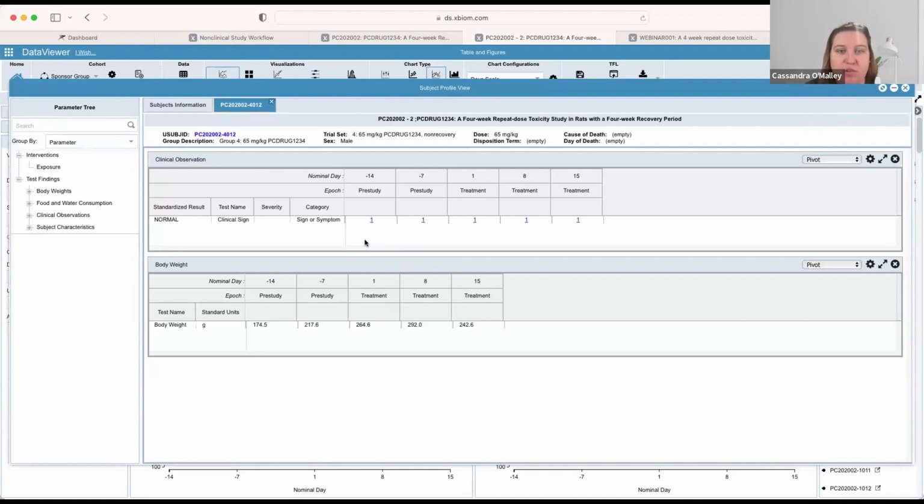So with no abnormal clinical signs, we might alert a study monitor at this time to evaluate the subject more closely. This may even trigger some GLP, OECD guidelines, following into, I think this is actually a 20% loss here, that may fall into euthanasia criteria. But again, this is a made up study.